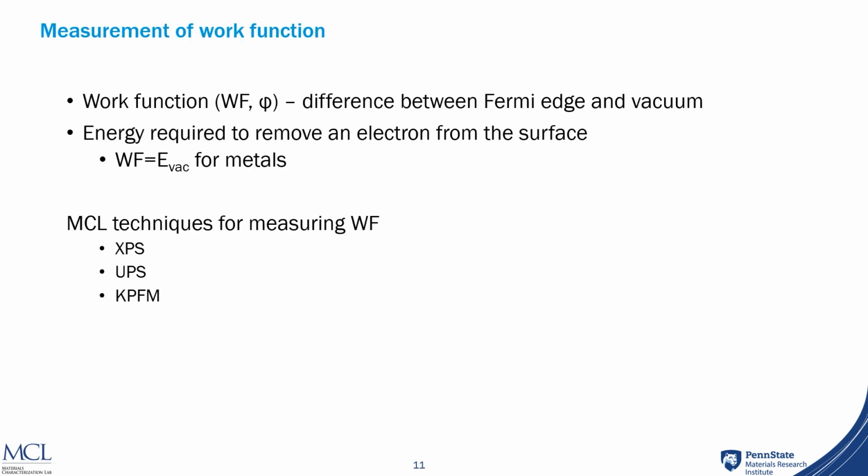So another parameter that's important to people that are making devices and electronic materials is the work function. Work function is the difference between the Fermi edge and the vacuum level, or another way to put it is the energy required to remove an electron from the sample surface.